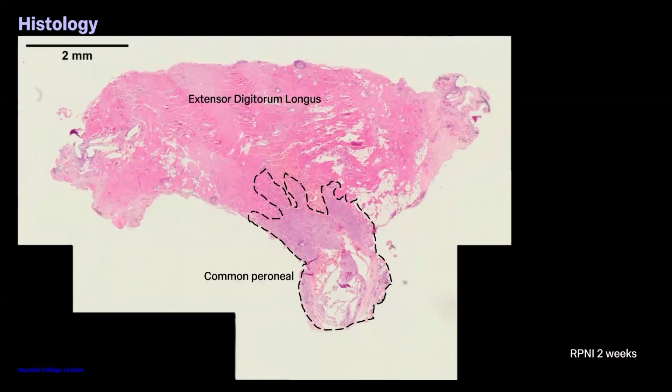I think it took about 10 seconds to acquire across the whole image, which is quite fast. It's automatically stitched, and allows us to get a very good holistic view of the kinds of tissue regeneration that we hope to see, with the whole tissue architecture preserved.